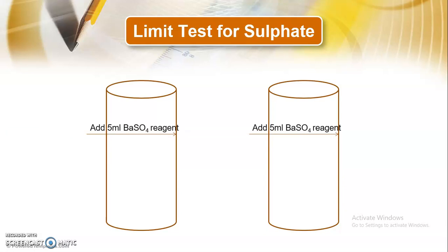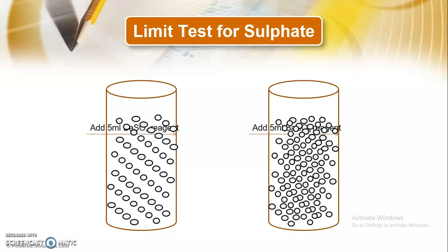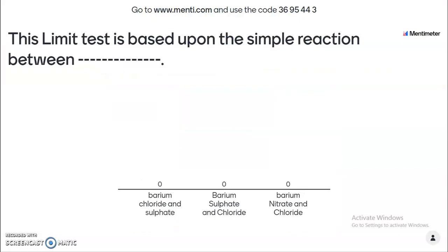Next, add 5 ml of barium chloride reagent to both solutions. The barium chloride reacts with the sulphate, leading to formation of a precipitate of barium sulphate. As you can see, the test sample shows less opalescence — a less turbid solution — compared to the standard. If the opalescence produced in the test solution is less than that of the standard solution, the sample passes the limit test for the sulphate.